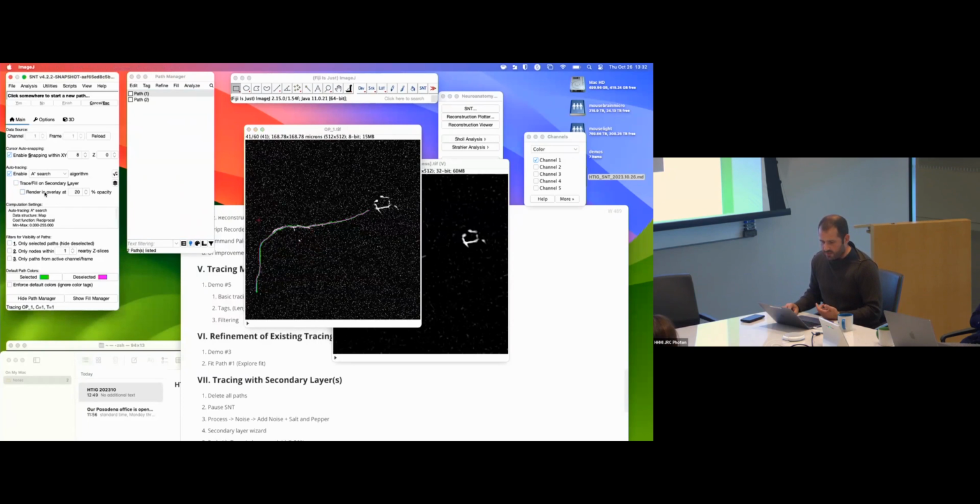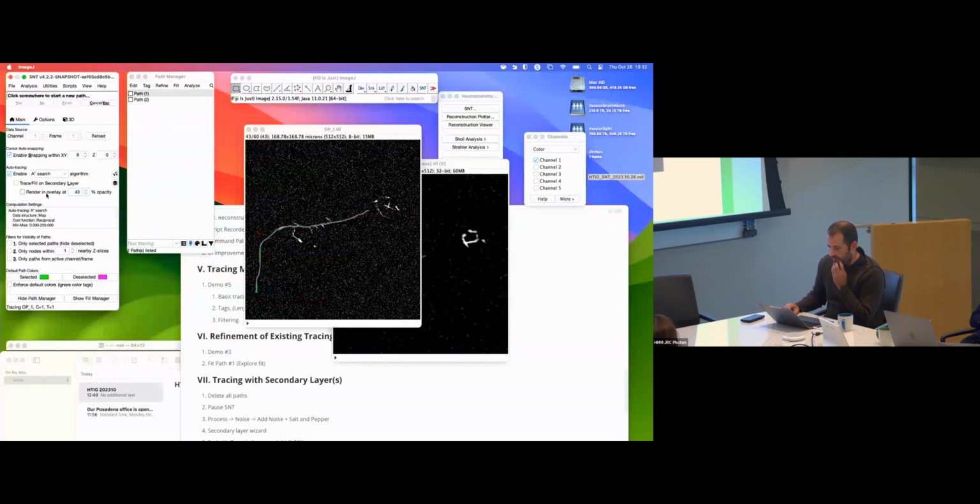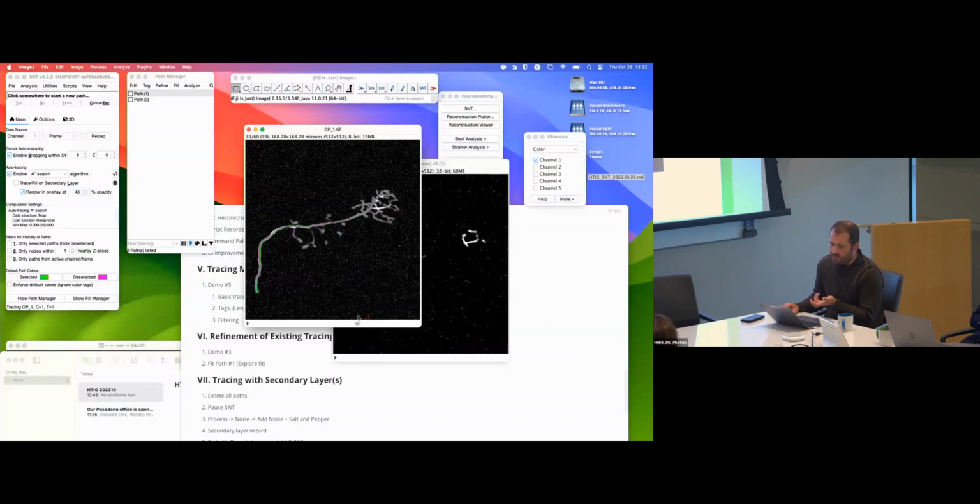You can overlay the filtered version to have some enhancement. In this case, you could make it 40%, I guess, or something. So now, this is just an image overlay. You are still tracing on the raw data. So that's another neat feature. And also surprisingly, people have been using these just to generate filtered images that you can then threshold, or you can do other stuff with it.